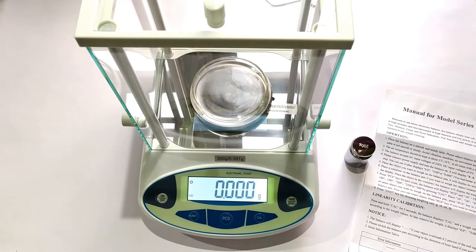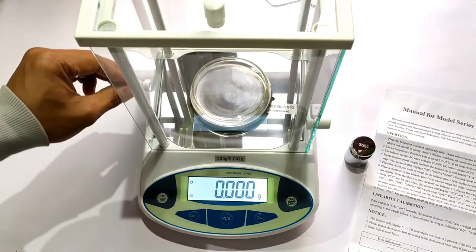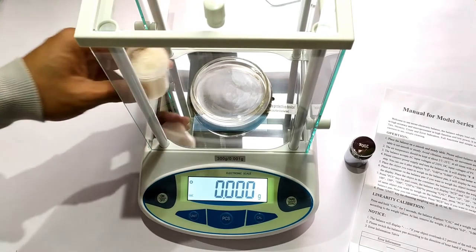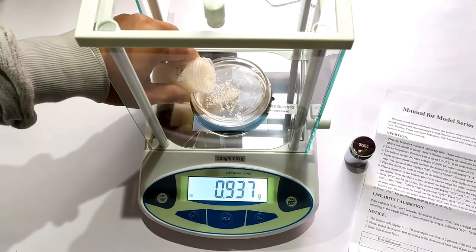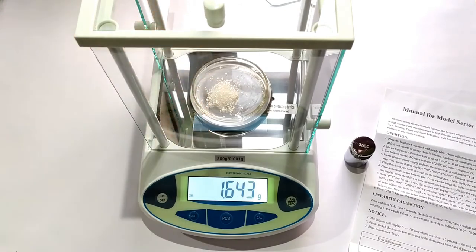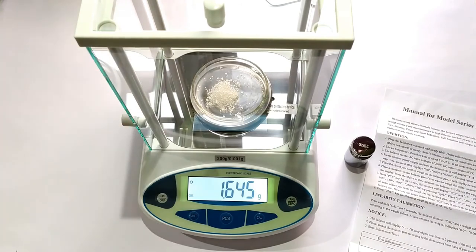Once the balance has been tared, we add the substance to be weighed. We now carefully close the weighing chamber and leave it for several seconds to allow the chamber to stabilize. And let's find out how much the values fluctuate.